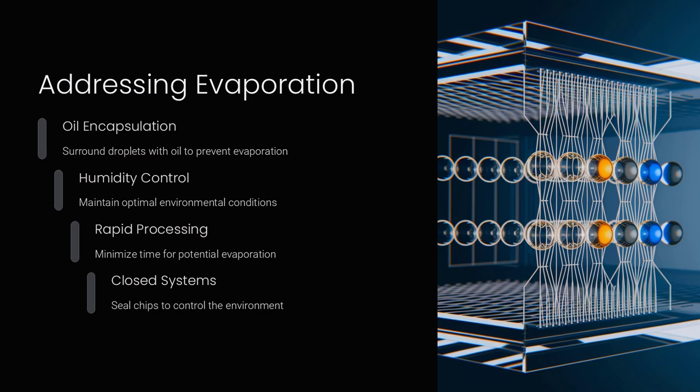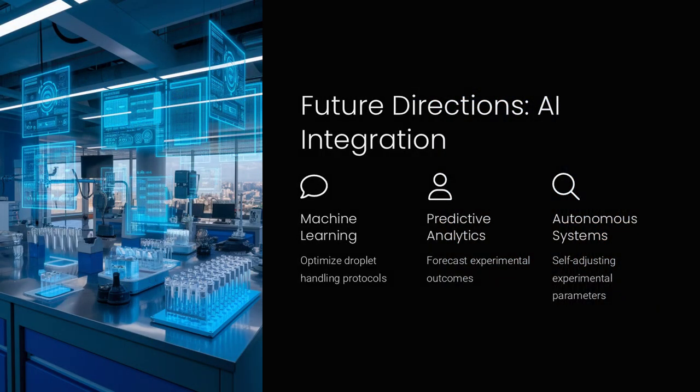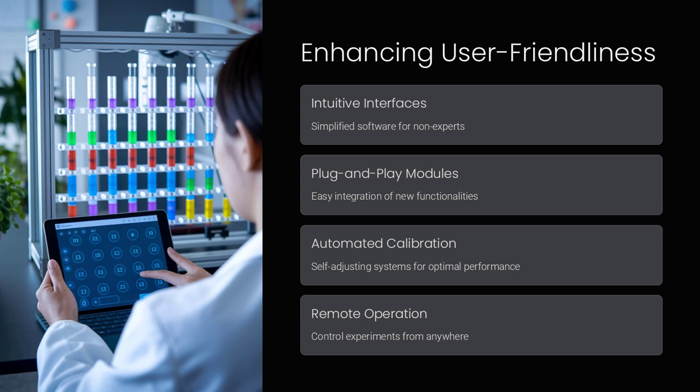Digital microfluidic platforms are often integrated with sensing and detection systems to monitor reactions in real time. This integration can include optical, electrical, or chemical sensors that provide immediate feedback on experimental conditions, allowing for dynamic adjustments and enhanced overall process control. The synergy between droplet manipulation and detection makes the platform a powerful tool for diagnostic and research applications, and it also facilitates the automation of decision-making processes based on sensor data.